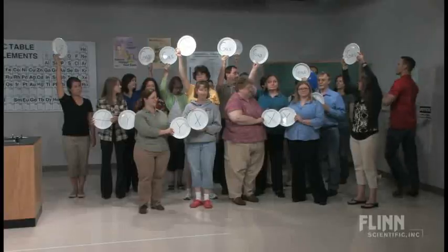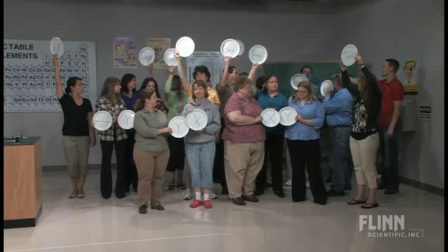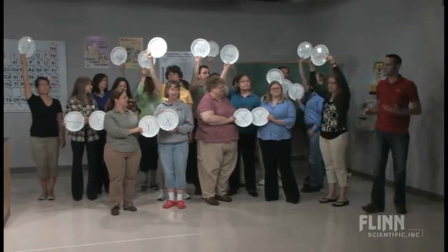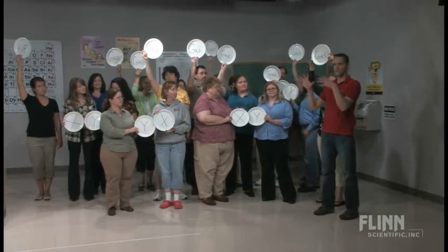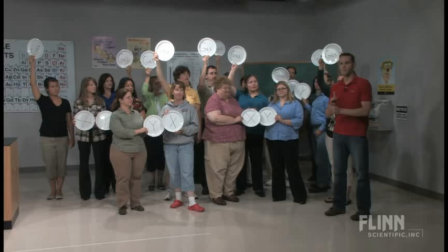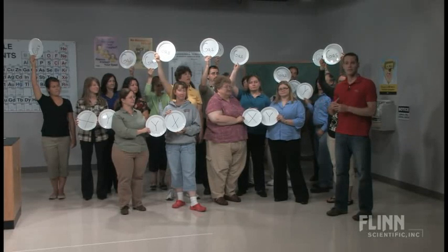And back here, do we have an X in the back somewhere, or Y back here? All right, so this Y can come back, steal that X away, and that gas is going to start to go up. So it's a nice demonstration that students can start to visualize. I usually actually have them all facing each other so they can watch the reaction happening. It's a nice way that they can visualize what's happening without drawing a single molecular structure, without talking about reaction mechanisms in a mathematical sense. It's a really nice, elegant way to show visually what's happening.